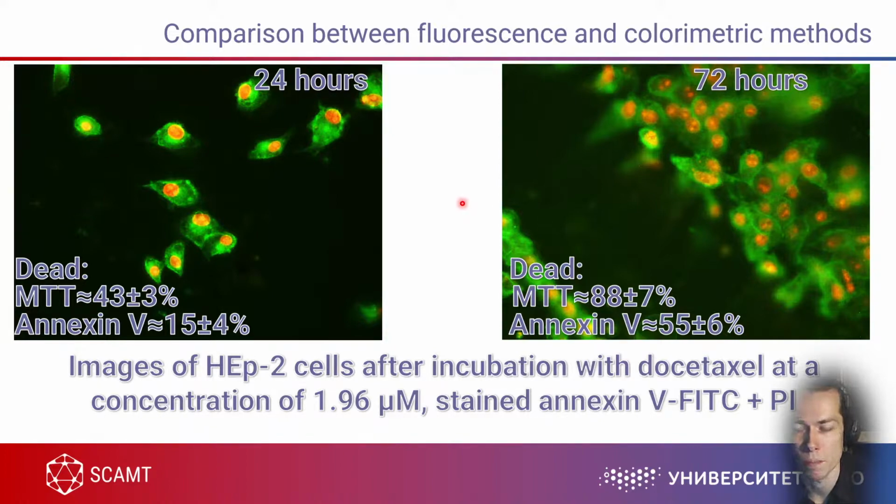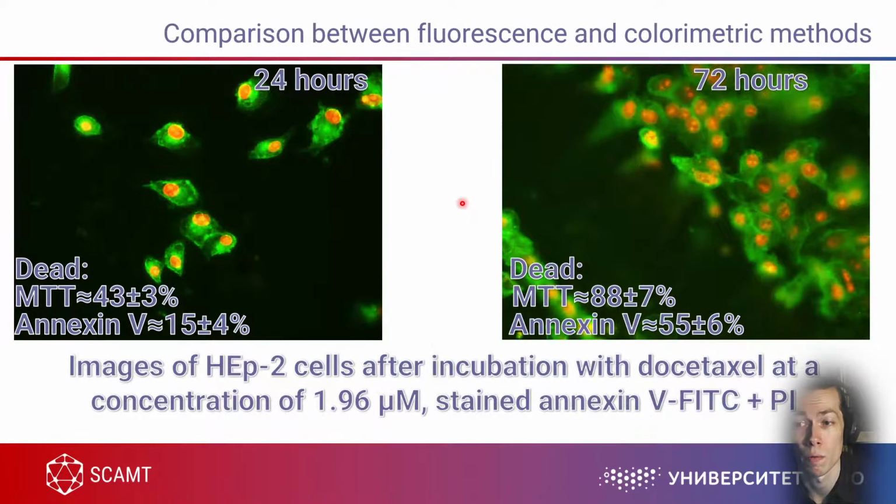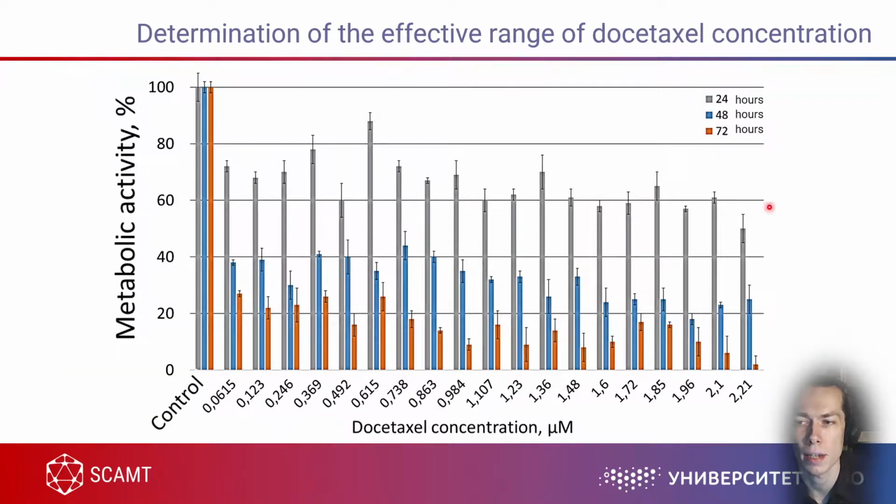Why does this happen? Again, the first thing is connected with the mode of action. As I mentioned, that drug can kill only cells in mitosis. And we're working with cells, and these cells were in a synchronous state. So it was like 100% confluence, and all of the cells were in G0 phase, maybe.